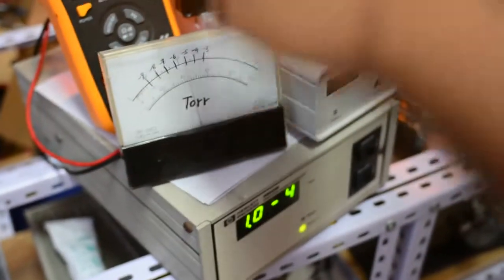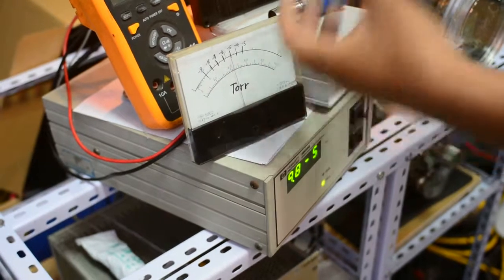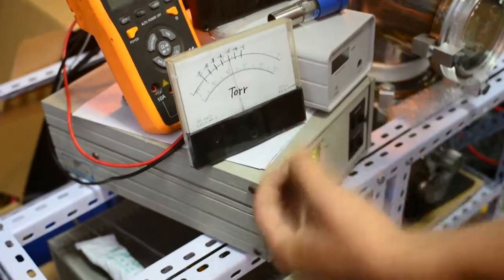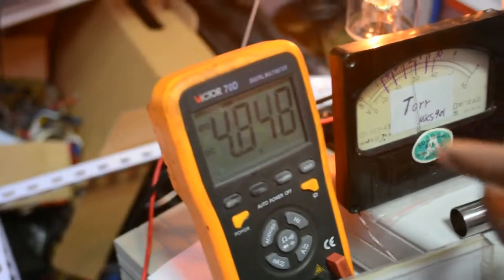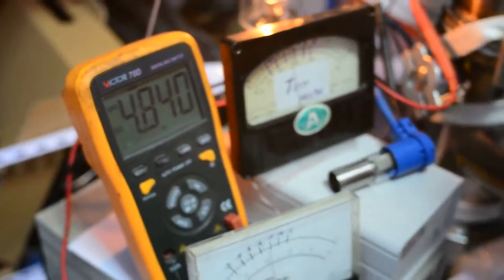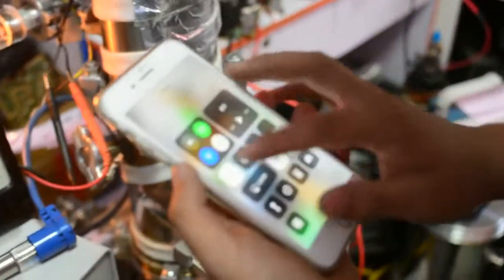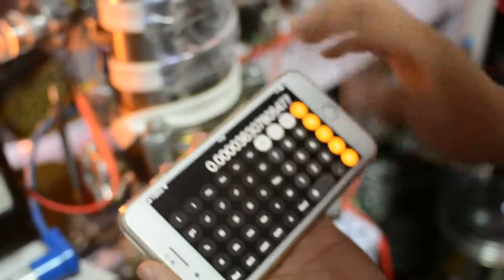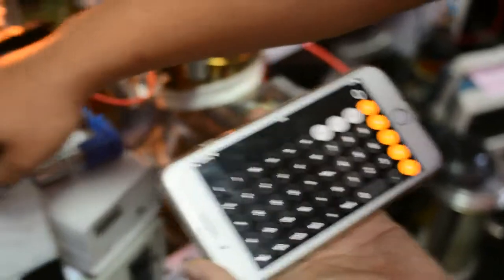This gauge reads out in analog voltage level, but to get a very accurate vacuum reading, I have to use a voltmeter to measure the voltage and then calculate the vacuum level myself using a calculator. There are basically a lot of calculations to be done. Right now it's reading 4.8 volts.